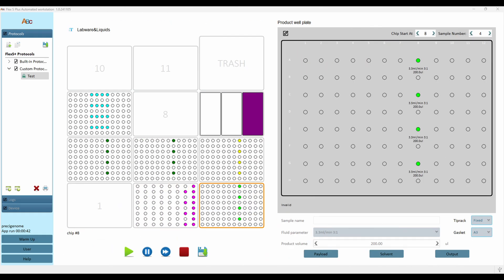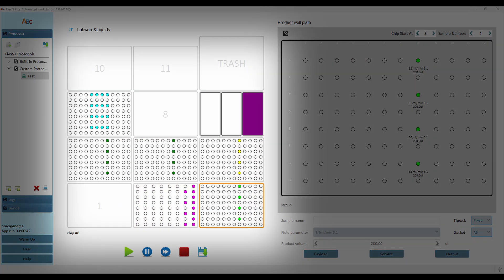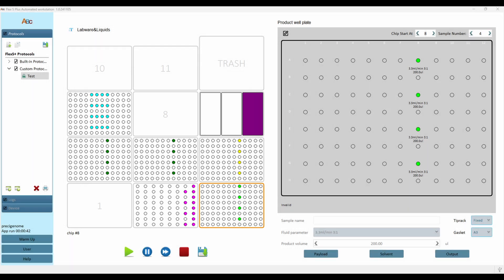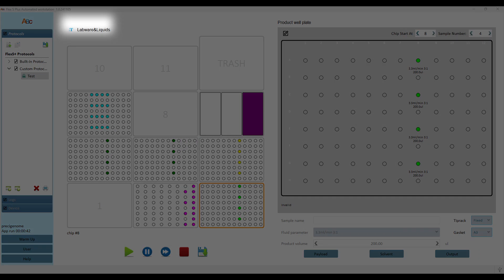Required consumables and samples are highlighted for ease of recognition. Furthermore, LabWare settings allow the user to load different device profiles for various third-party consumables.